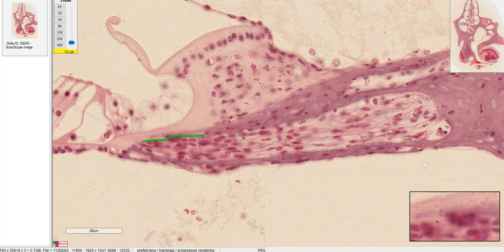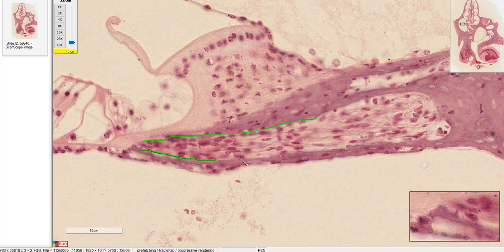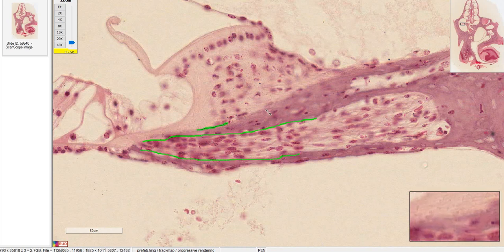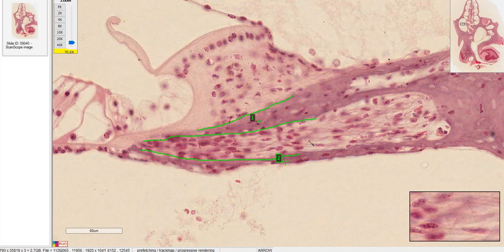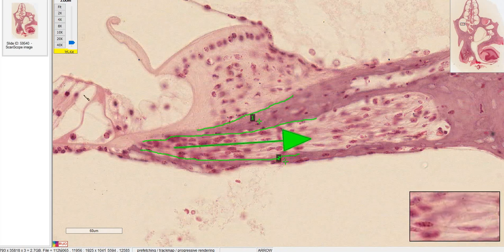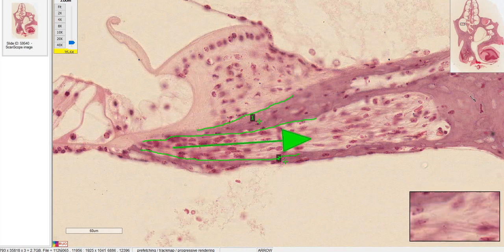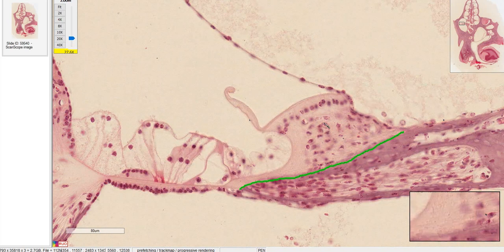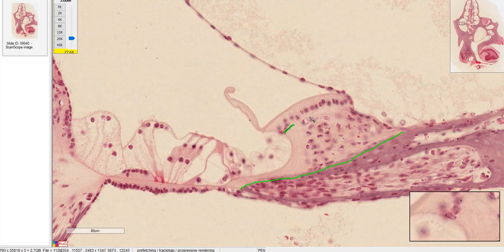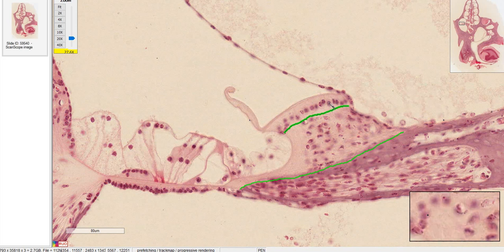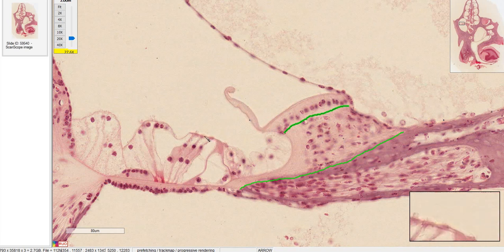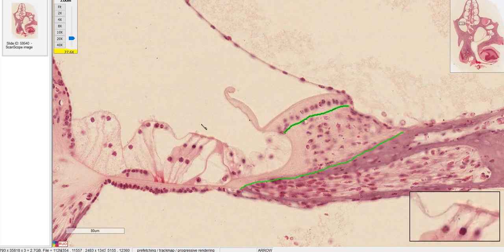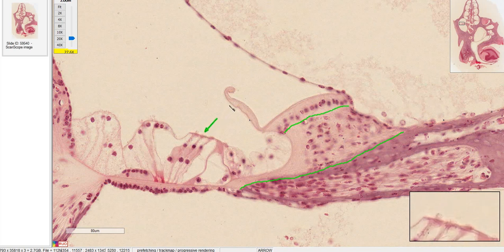The lab manual describes the osseous spiral lamina as two bony shells, and in between are the axons of the hair cells traveling to the spiral ganglion. The structure above is the spiral limbus. The epithelium of the spiral limbus secretes the tectorial membrane. On the slide it looks separated from the outer hair cells, but normally it's actually supposed to be attached.